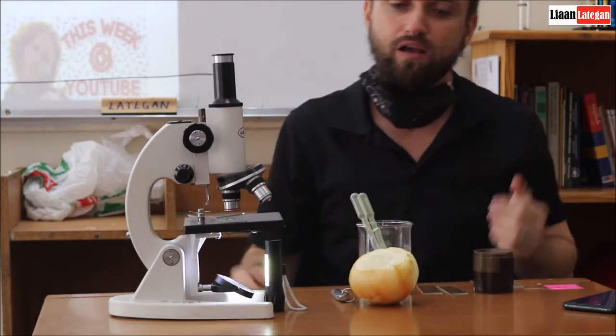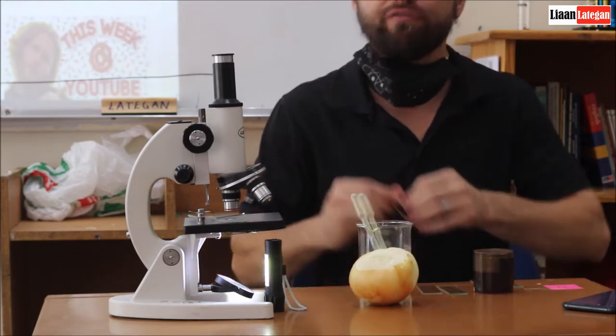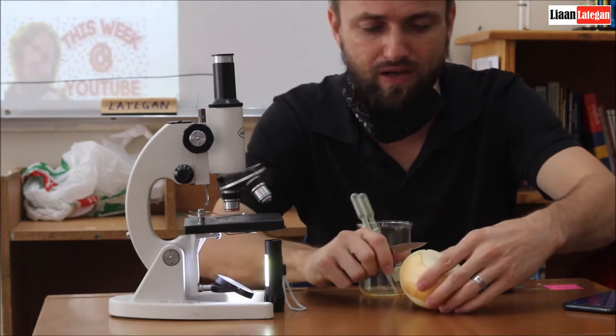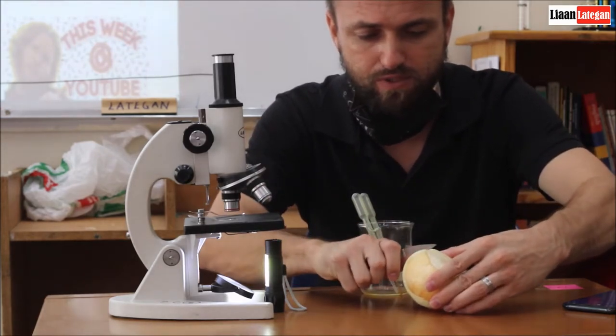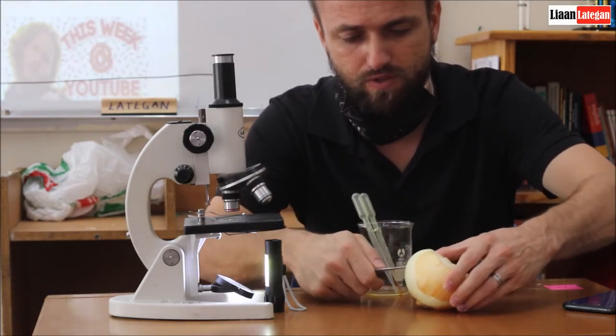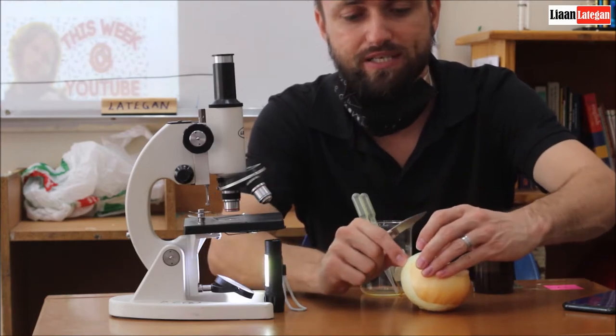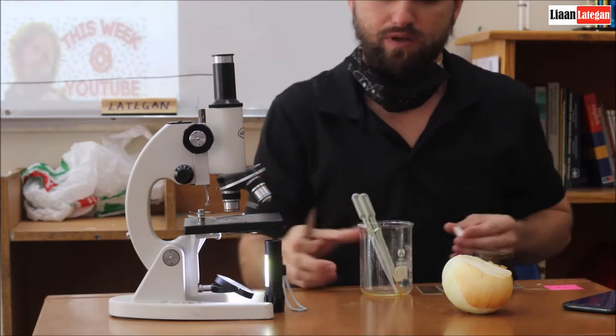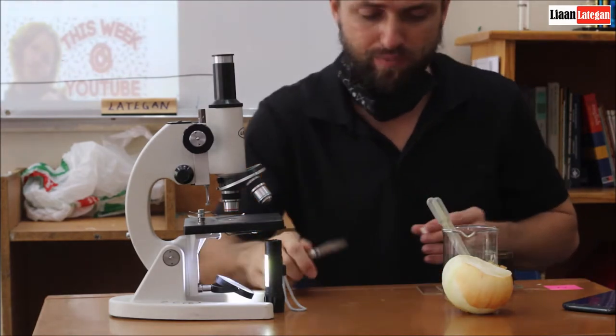Then we are going to utilize a sharp knife and cut a piece of onion. What we want is the epidermis layer or a skin from the onion.